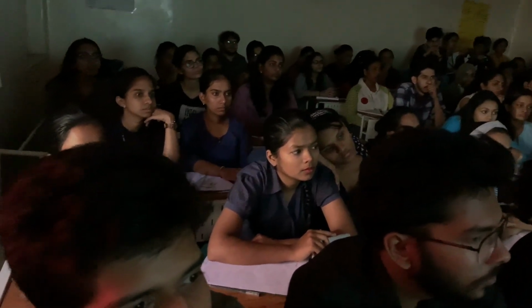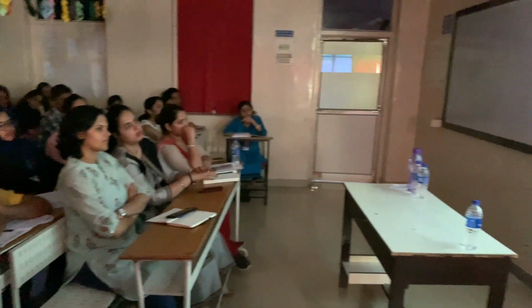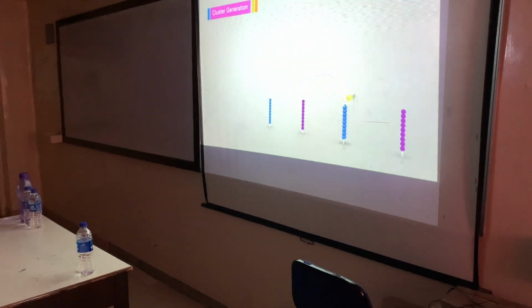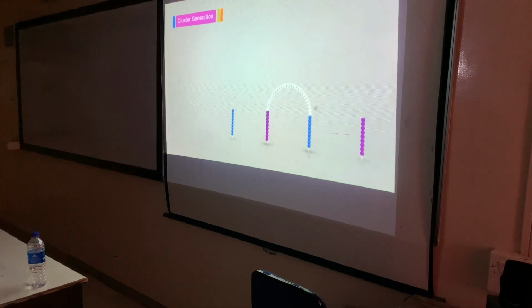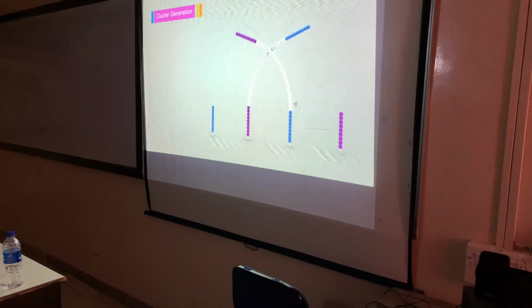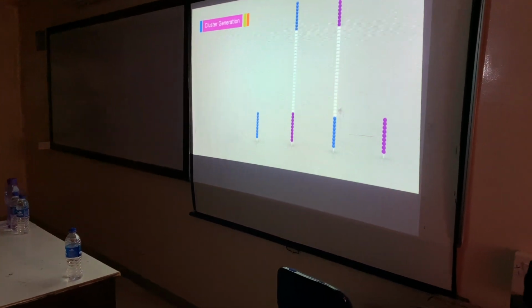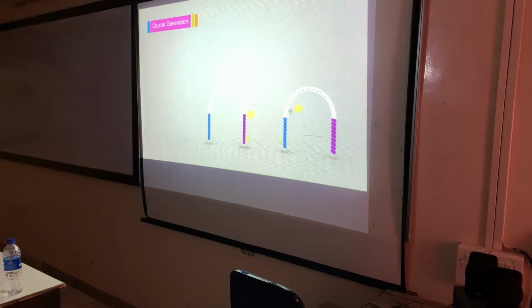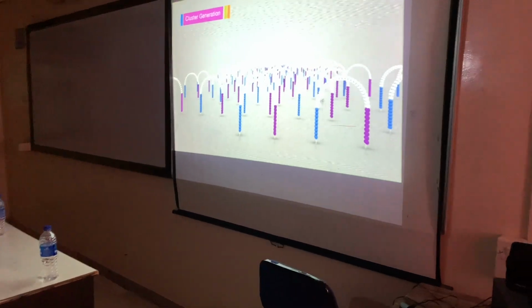The strands are clonally amplified through bridge amplification. In this process, the strand folds over, and the adapter region hybridizes to the second type of oligo on the flow cell. Polymerases generate the complementary strand, forming a double-stranded bridge. This bridge is denatured, resulting in two single-stranded copies of the molecule that are tethered to the flow cell. The process is then repeated over and over and occurs simultaneously for millions of clusters of all the fragments.